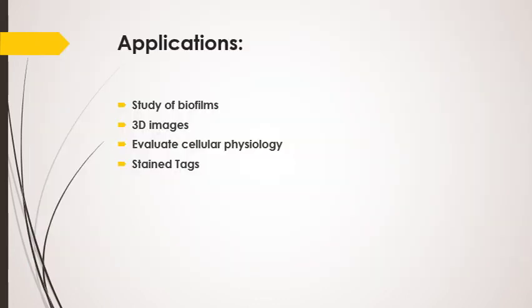So here we have the applications of the confocal microscope. First of all, with the help of the confocal microscope, we are able to study biofilms without disturbing them, which can form on many different types of surfaces, including in developing medical devices such as hip joint replacements. It is difficult to kill all cells in a biofilm. So this makes them a particular concern to the medical field, because formation of biofilm on medical devices results in infections that are difficult to treat.